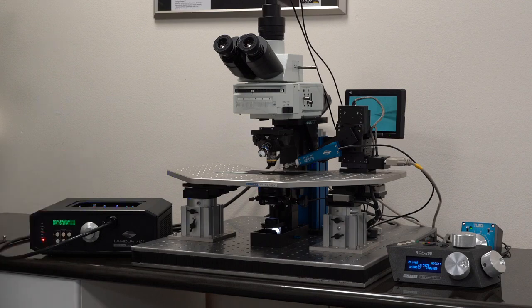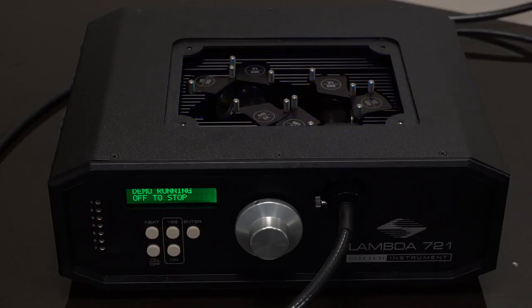This LED cube contains the LED, optics, and a single filter in an assembly that's easy to change. The unique light path allows for any user to install the LED in any position without concern for spectral order.